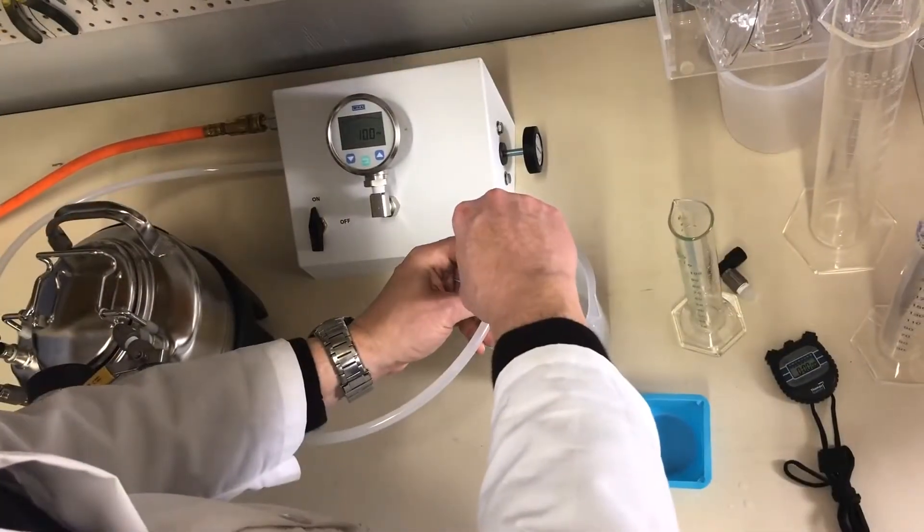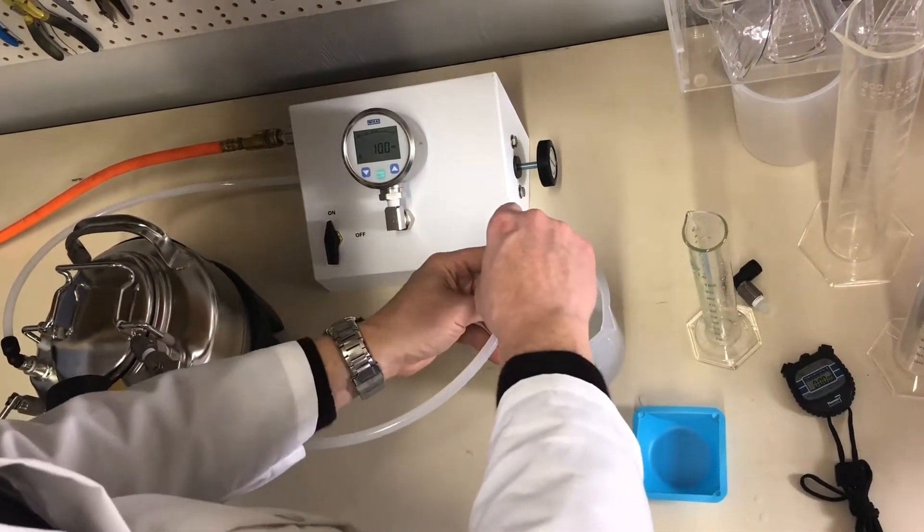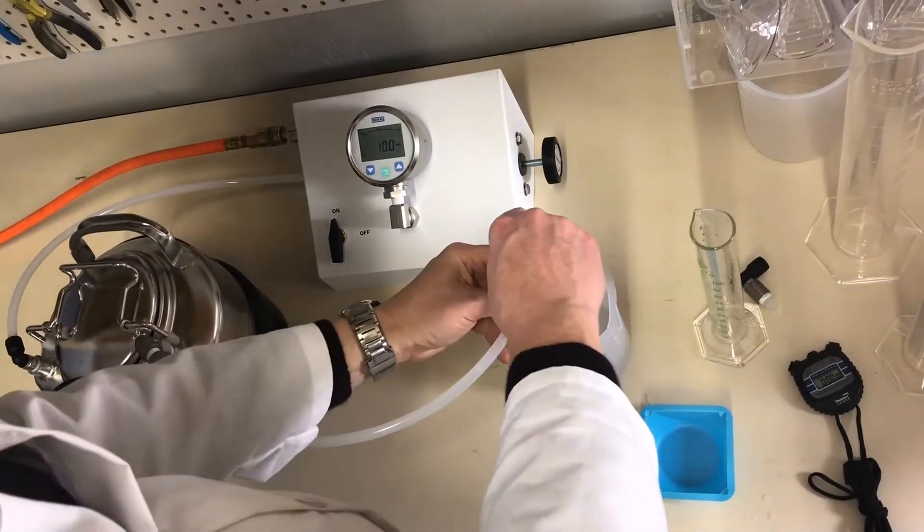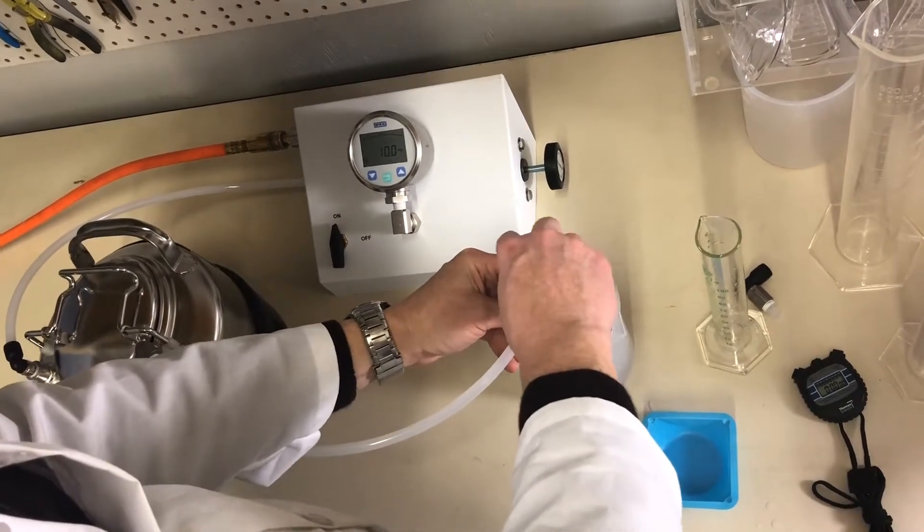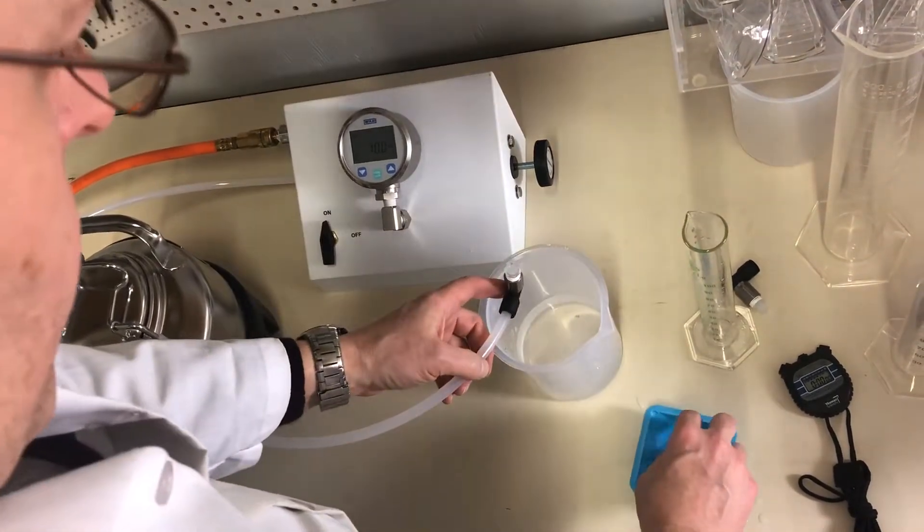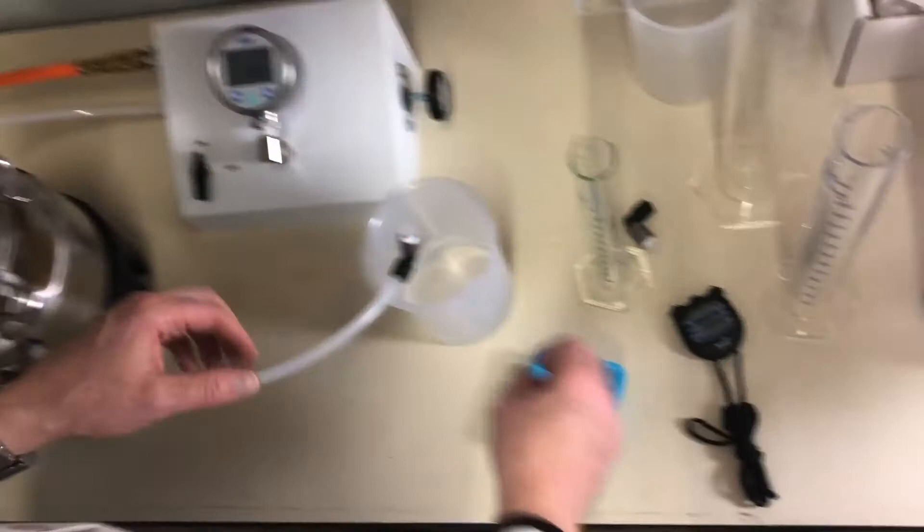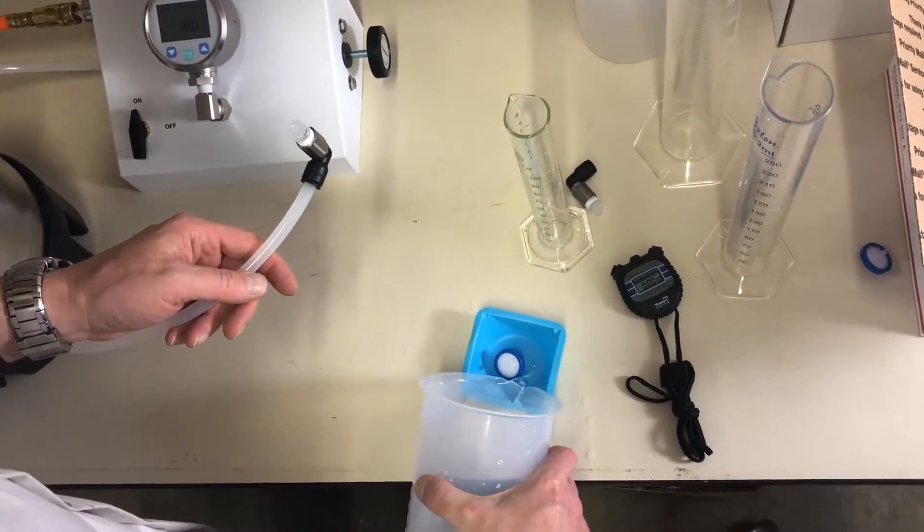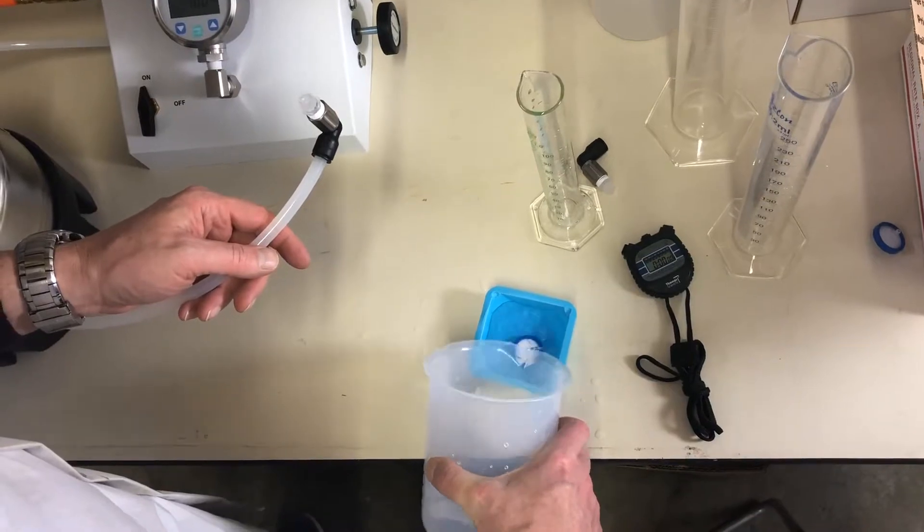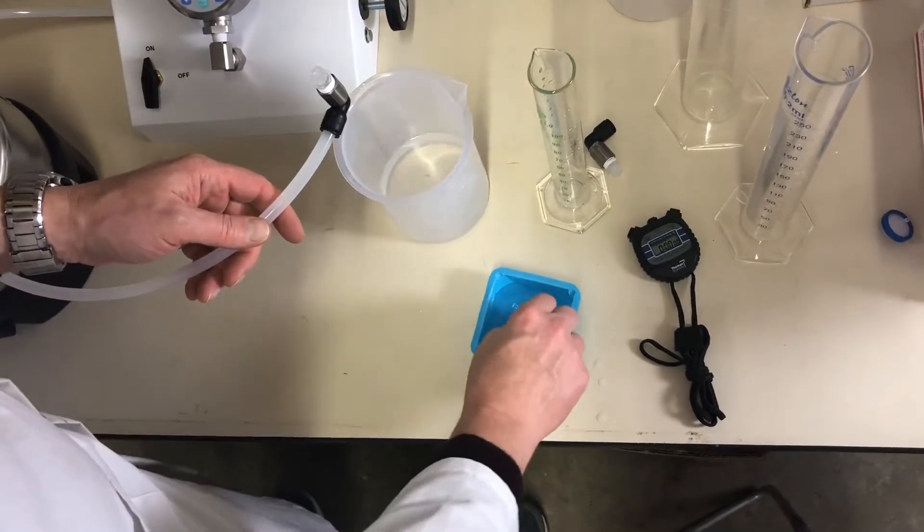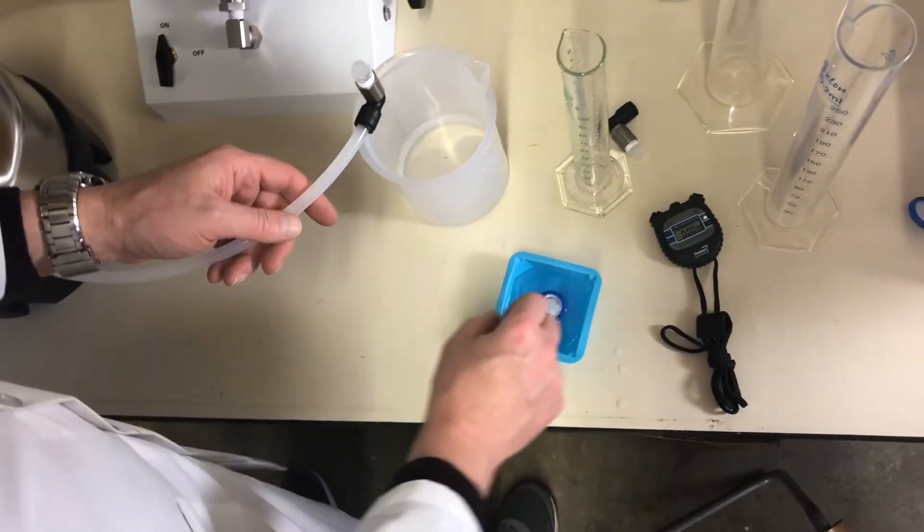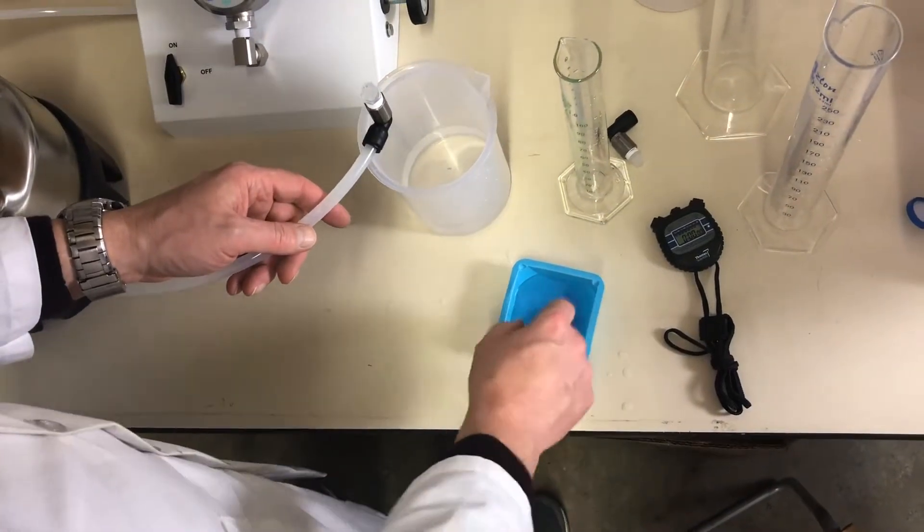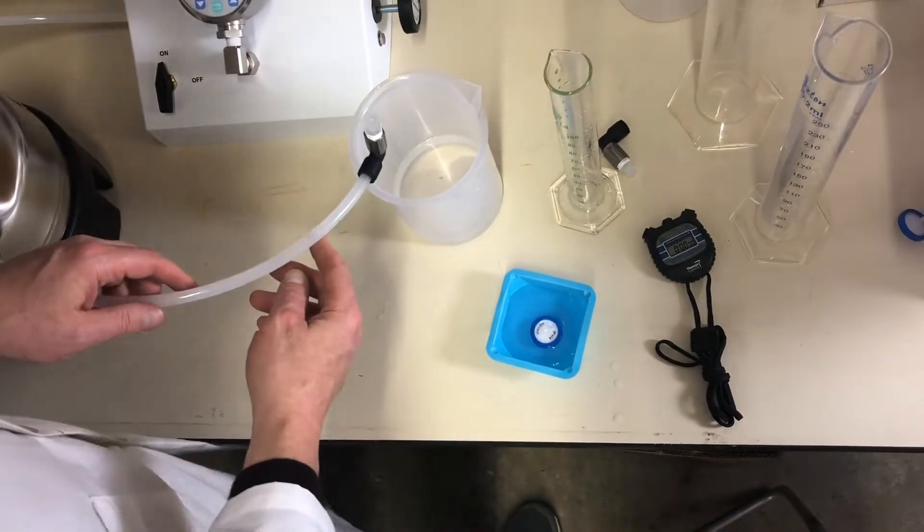Make sure the valve is closed. Unscrew the filter to remove it, then store it in the dish full of water to make sure that it stays wetted prior to bubble point testing.